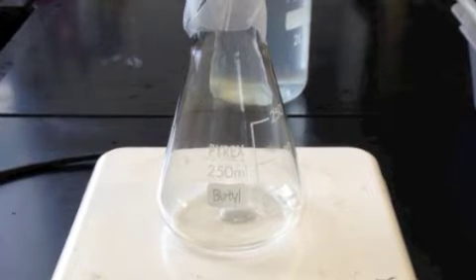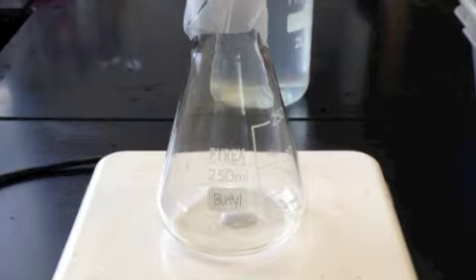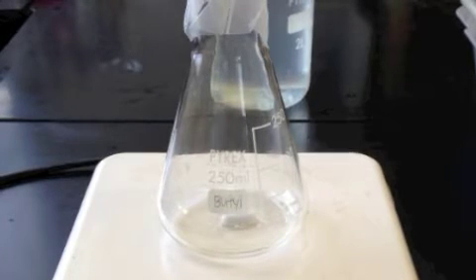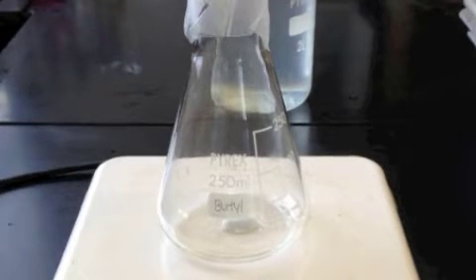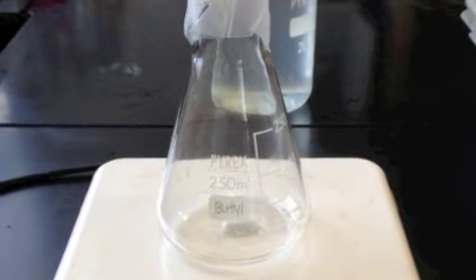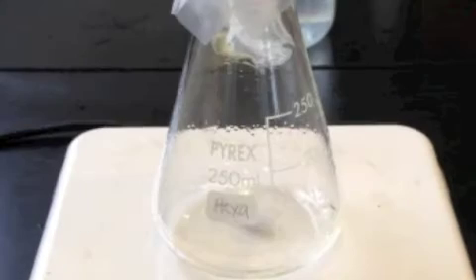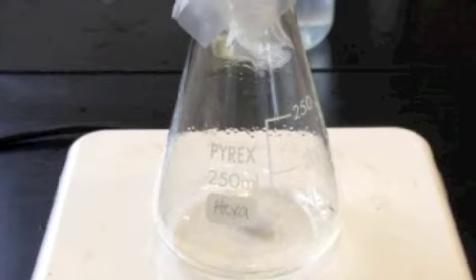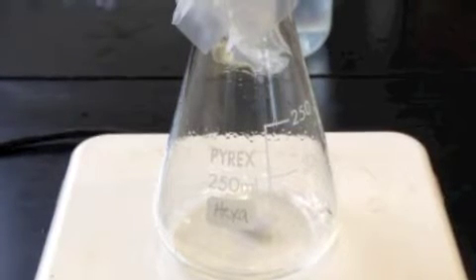The heating and stirring of the solution in the flask serves to increase the amount of movement of the molecules, causing them to collide with one another and react at a greater rate. The temperature designated for use was 45 degrees, as lesser temperatures resulted in the reaction rate being increased to a lesser extent, and the greater temperatures resulted in gas causing the paraffin wax cover to pop off.